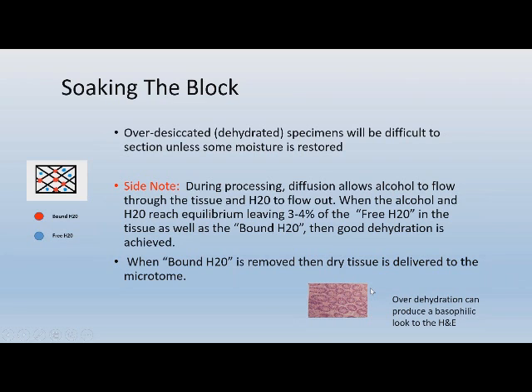And we all know that when you soak tissue, you sit there and you try to sneak up on the tissue block so that you can actually get a ribbon on the first couple of 3 pieces, and you're going to grab one of those. And I can assure you that normally they're not 5 microns or 4 microns. One of them might be, but the next one is about 7 or 8 microns. It's just the way that soaking works.